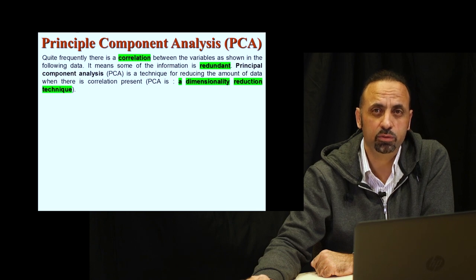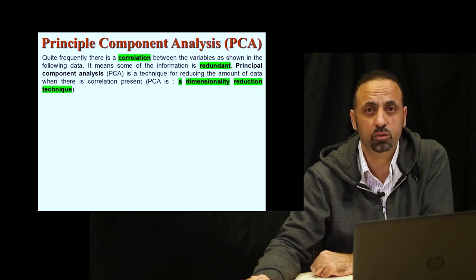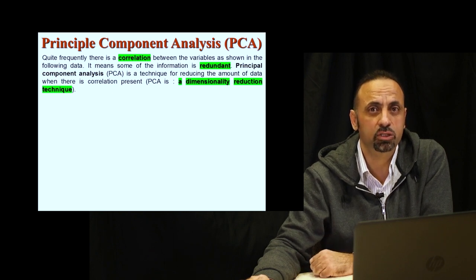Sometimes the variables used for making a prediction, especially for spectral data, you can find a correlation between variables. And of course, you cannot use variables that are already correlated. Correlation means they are the same. They have the same trend, even the same trend to grow together, or one to grow and another one to decline, an inverse relationship. You cannot use both parameters and both variables at the same time.